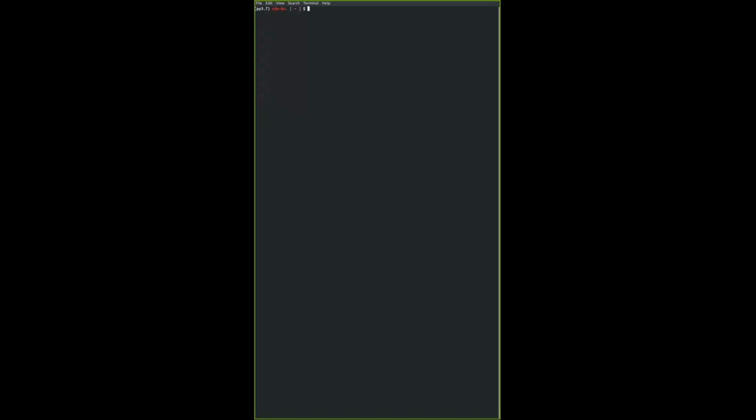Before we begin, I would like to very quickly recap the commands that we learned last 2 weeks. You don't have to follow along with me. I'm just gonna quickly show you what we have done. We will use some of this code in a bit, but not all of them. So you're not going to miss out on anything. Just to give a bit of refresher and understanding of what we have done.